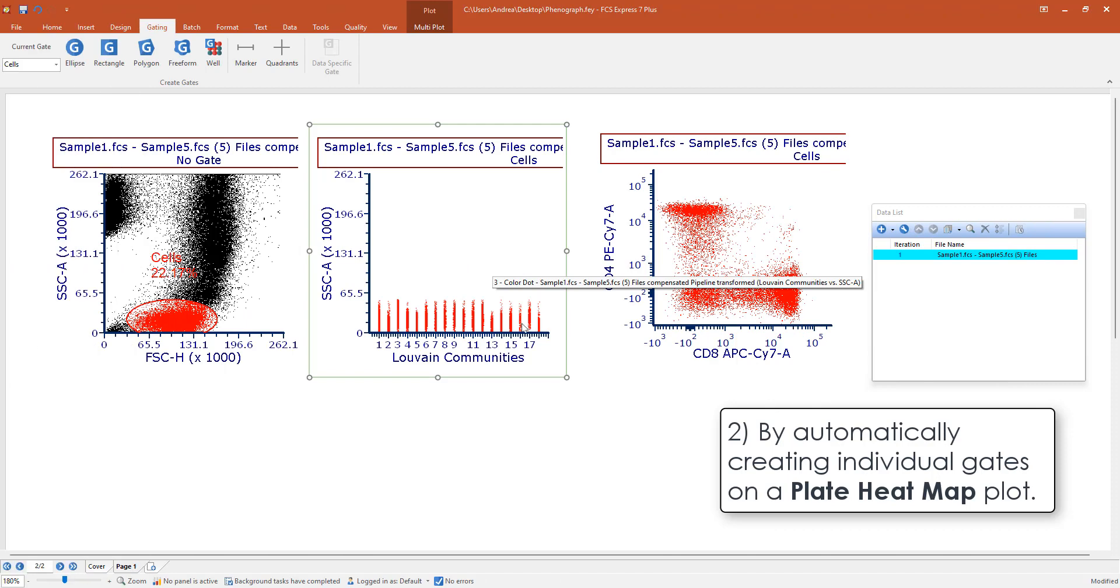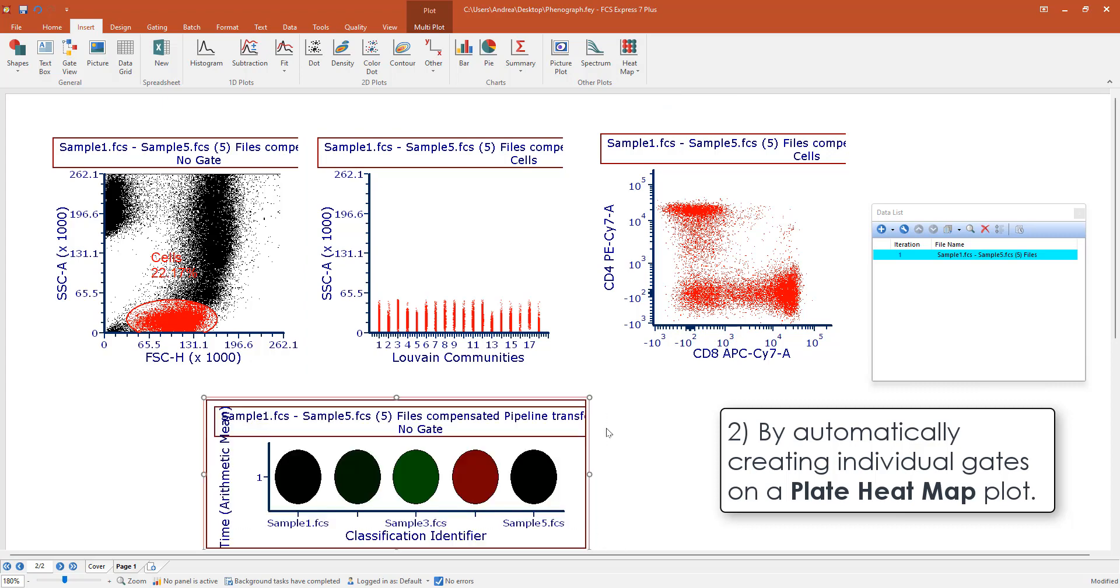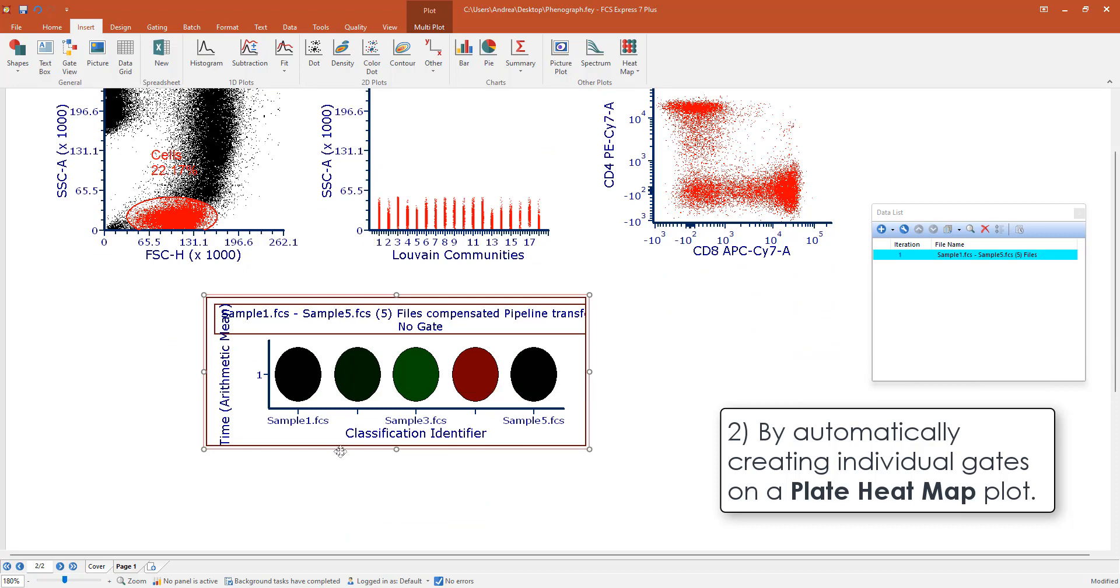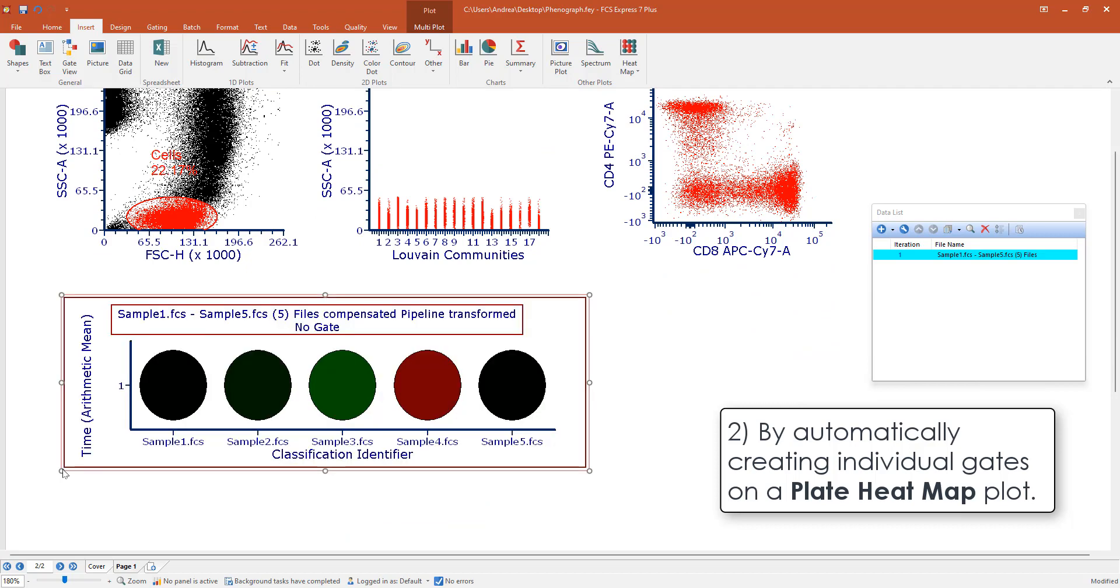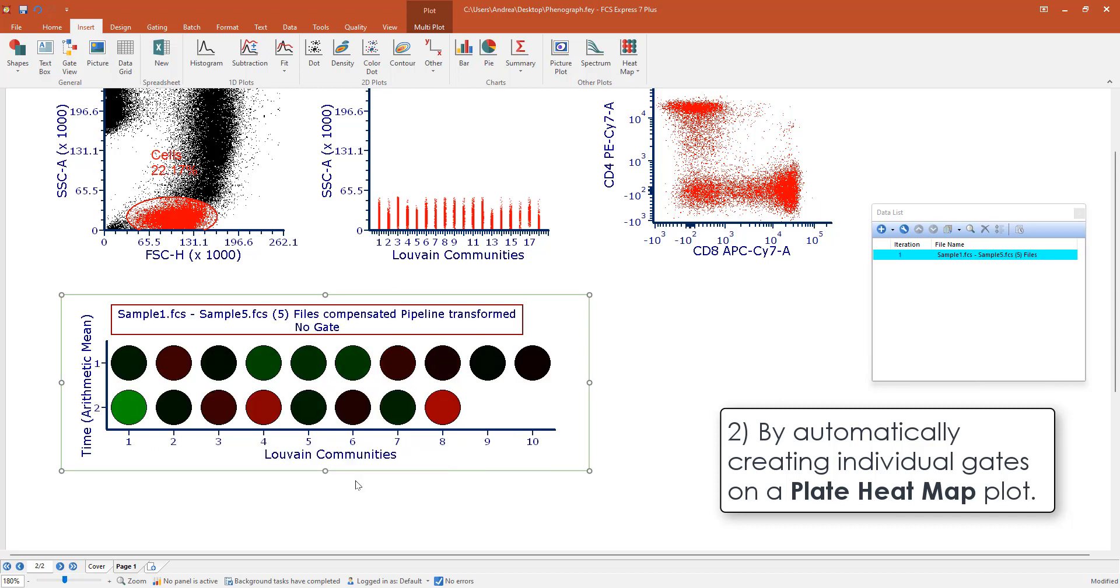The other way in which you can explore clusters in FCS Express, so this is true also for K-means, FlowSOM, SPADE, and in this case for Phenograph, is by inserting a plate heatmap plot. The plate heatmap plot is able to represent clusters but also classifications as a plate. So I want to change this to the Louvain community.